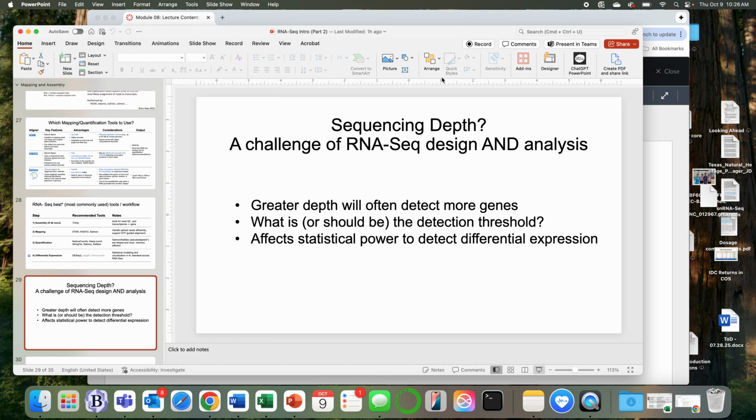So on that low expression stuff, do I want to say, oh, this sample is expressing that gene, but this one isn't? Okay? No, it's just that you randomly sampled that one.